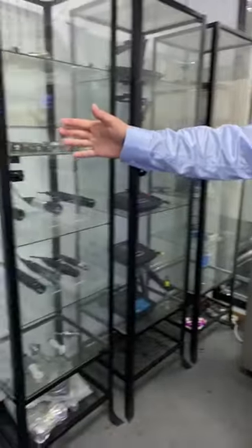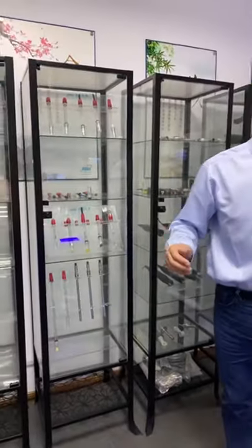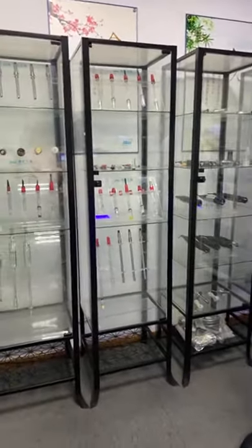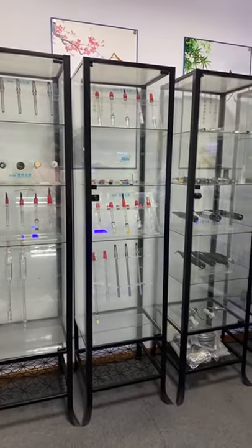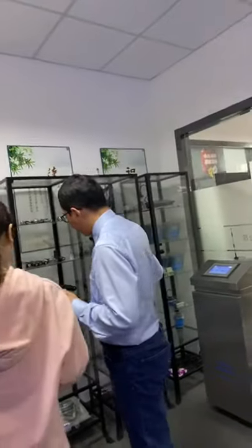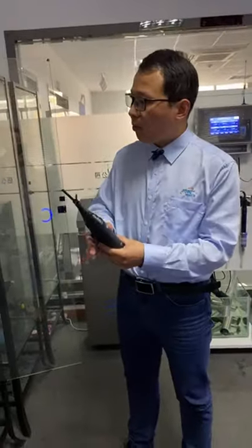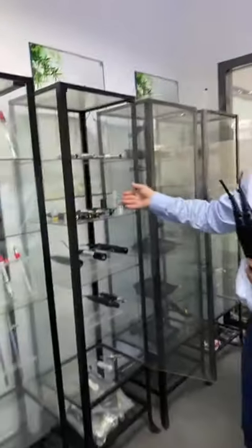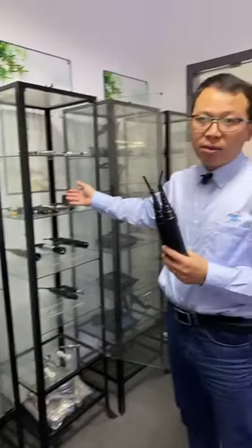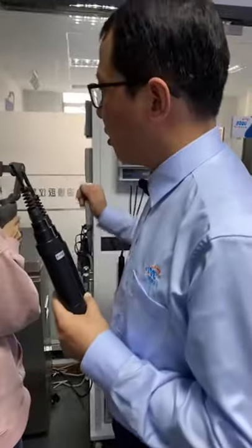By the way, for all these sensors, pH, conductivity, dissolved oxygen, turbidity, suspended solids, and COD sensors, they can also be digital type, directly with RS485. For this one, for example, we call it an analog sensor, and usually it should be connected with a transmitter for measurement.